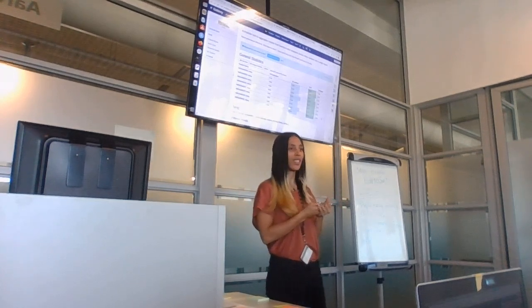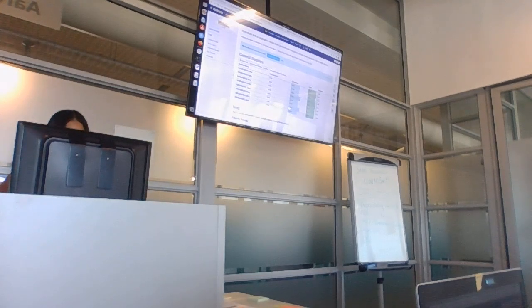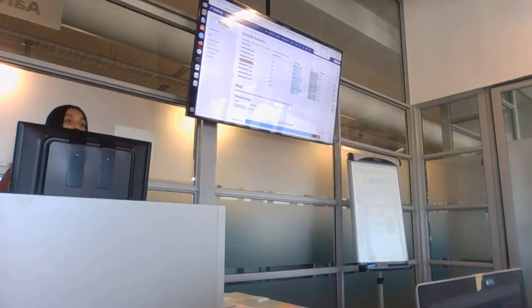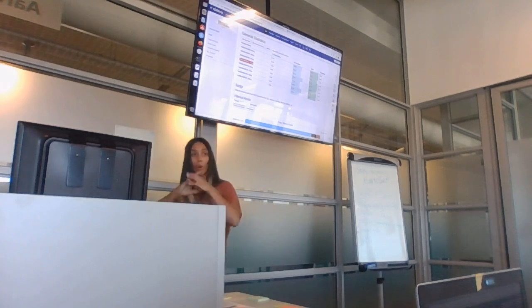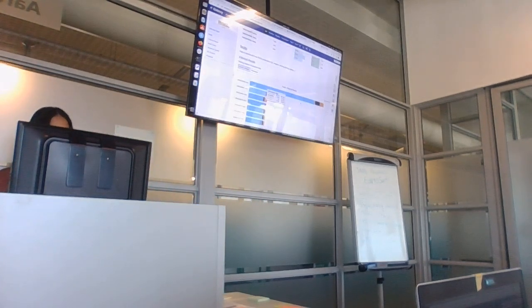Okay, but which files? Which 2 do you see? The 4th and the 7th. What is the file name ending? 61 and 88. What is wrong with it? High GC content compared to the others, right? So even if you didn't know anything about your sample yet, you would say, why is that GC content higher than the others? There's also, what do you see under filtered reads?